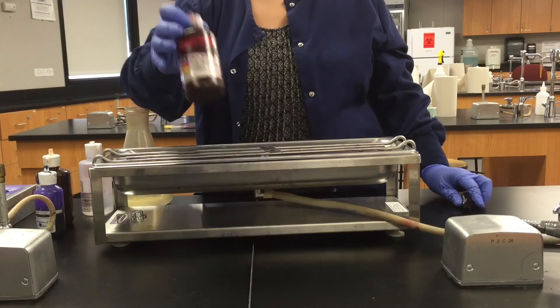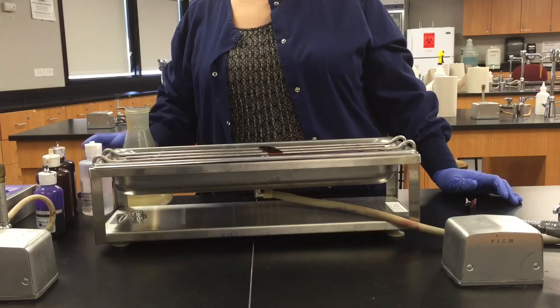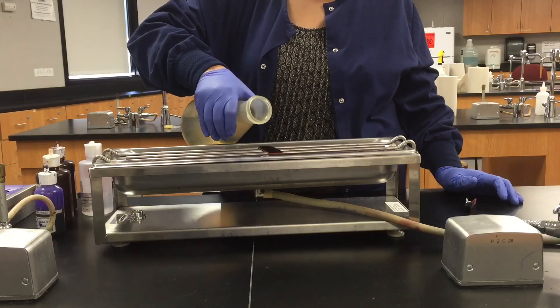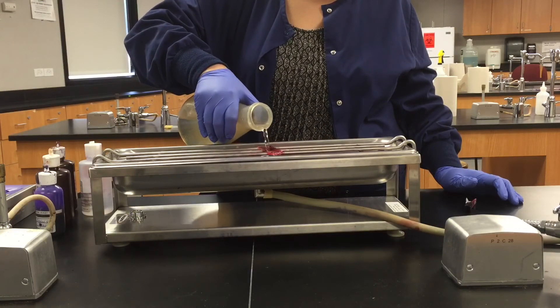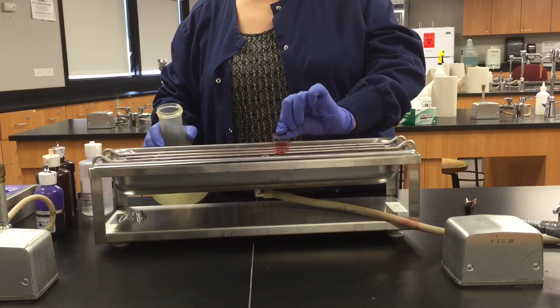Put the slide back down on the rack, finally cover it with the Gram's Safranin, and leave it on there for a minute. Give it one last rinse with water, and you are ready to blot it dry and view it.